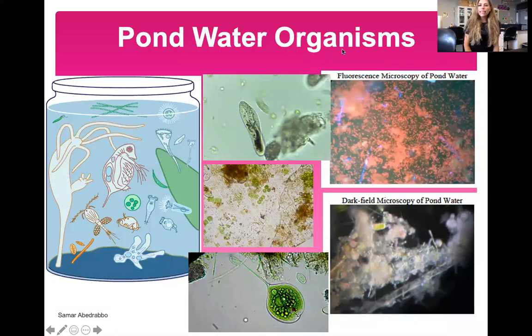Hi everyone, this is the pond water organisms lab. In this lab, I'm just going to talk about how we look at pond water organisms, and we're going to talk about wet mount and different microscopy techniques.